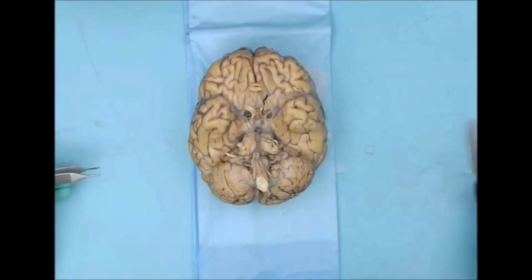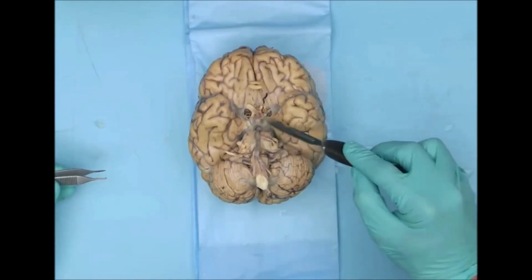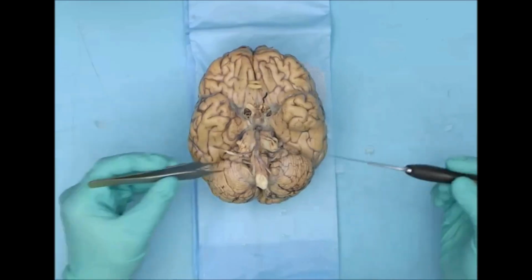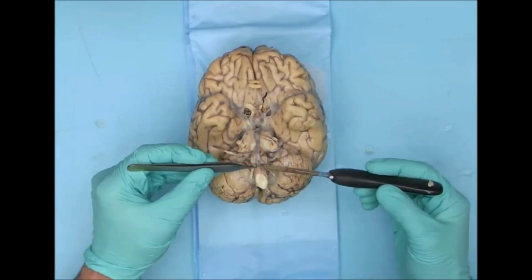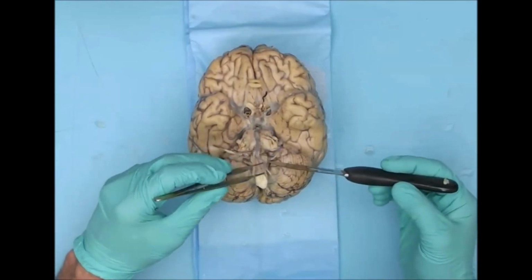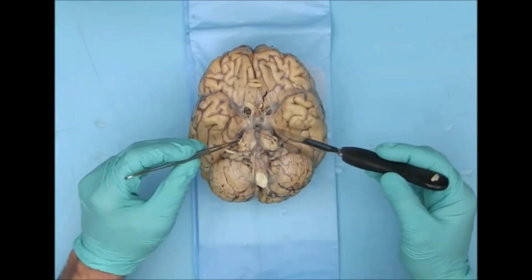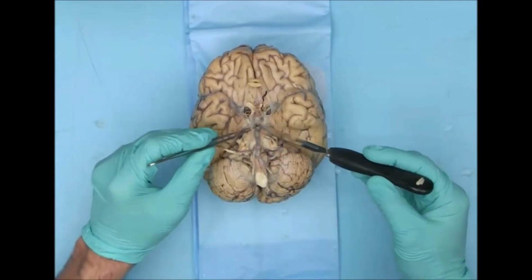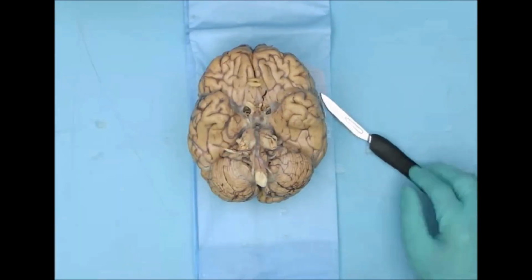So if you take a look, right in this area right here, there's a bunch of leptomeninges surrounding a bunch of vessels in this area. And right here you've got the right vertebral artery, left vertebral artery, the basilar artery. Then I'm going to dissect away this leptomeninges and come back to this and show you the circle of Willis in more detail.